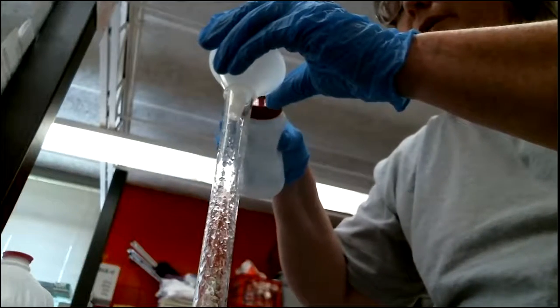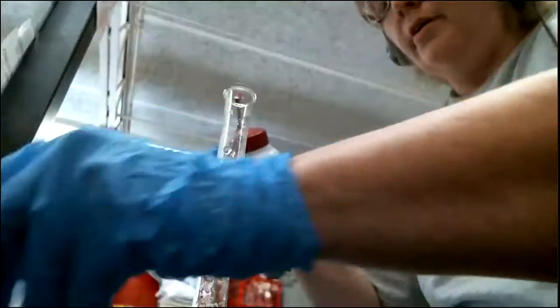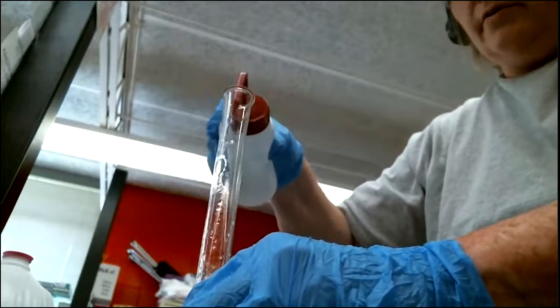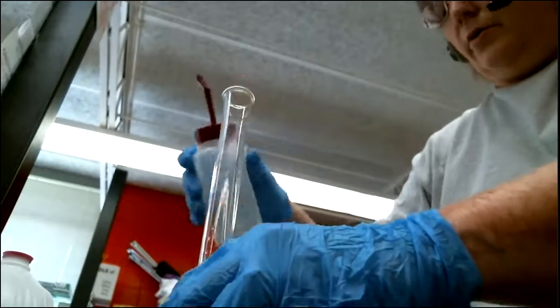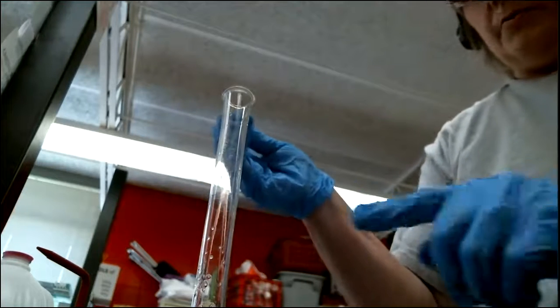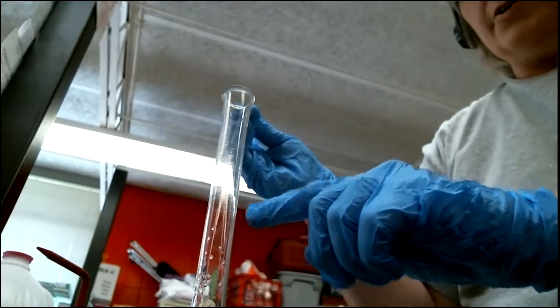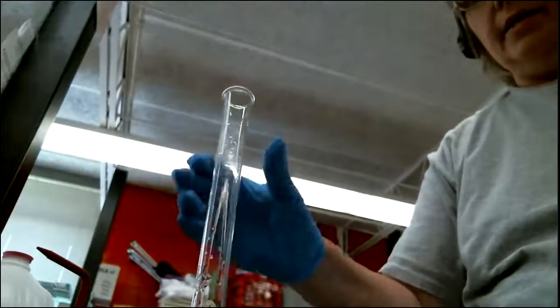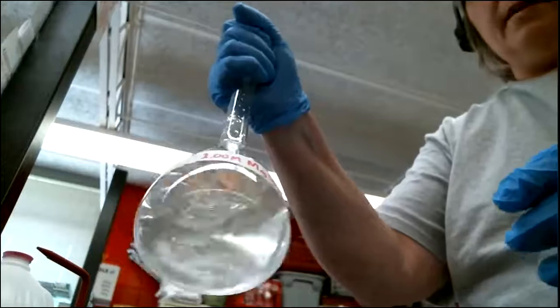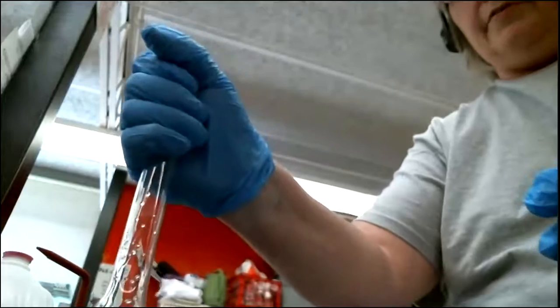Let me show you the mark real quickly. When you get to the end and you're trying to fill it up to the mark, you want to use either the wash bottle or a pipette. At the very end, when I just want to put a few drops of water in to get me up to the mark, I'm going to add it drop by drop. If I try to pour with a beaker or something like that, then I'm probably going to overshoot the mark and my whole solution will be messed up. So to get my right concentration, 1 molar magnesium sulfate, that's what I have to do.